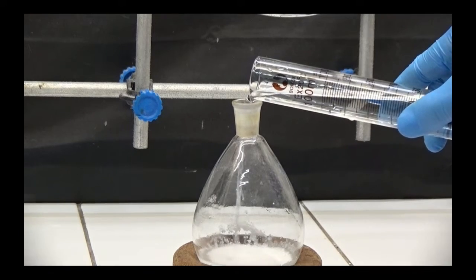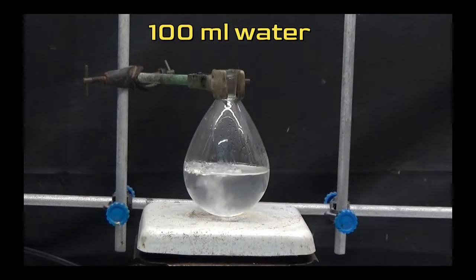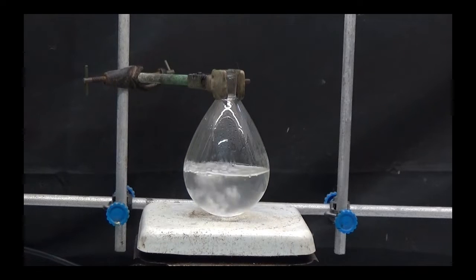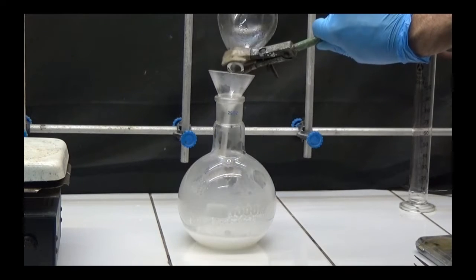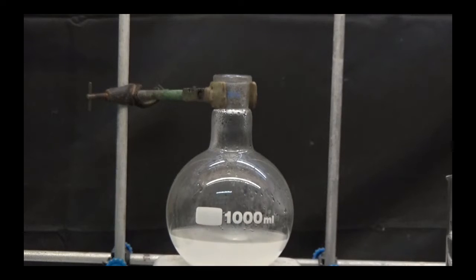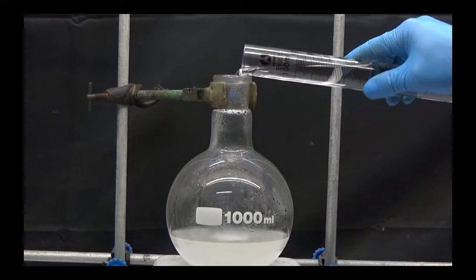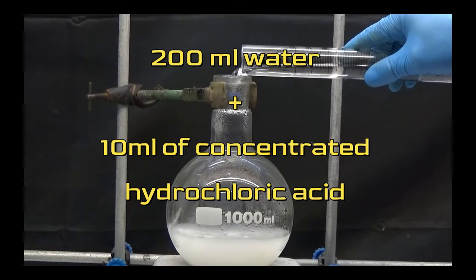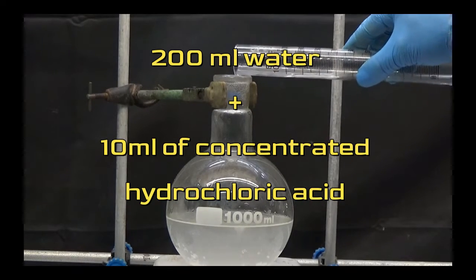Boil with 100ml of water for 10 minutes to remove all the residual methanol. Place the solution in a 1000ml flask. Add 200ml of water and 10ml of concentrated hydrochloric acid and heat at reflux for 1 hour.